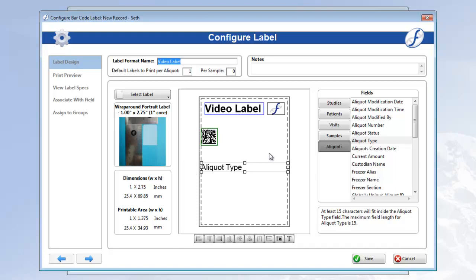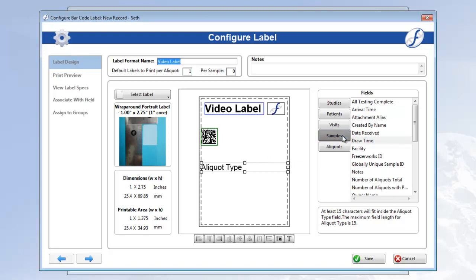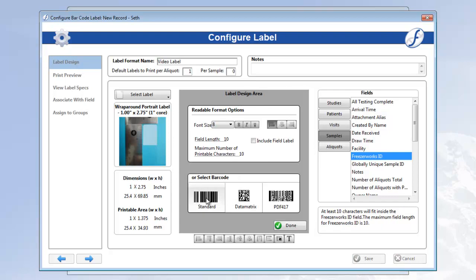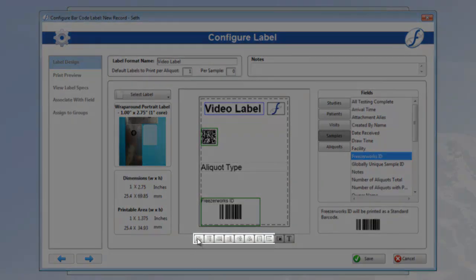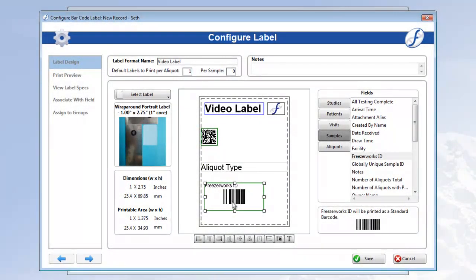I'll go ahead and add one more field to our label, freezeworks ID, a sample identifier, and we'll use a standard barcode. Why don't we organize these objects too? I'll highlight them all, and use one of these alignment tools that can be found in reports and samples entry configuration.